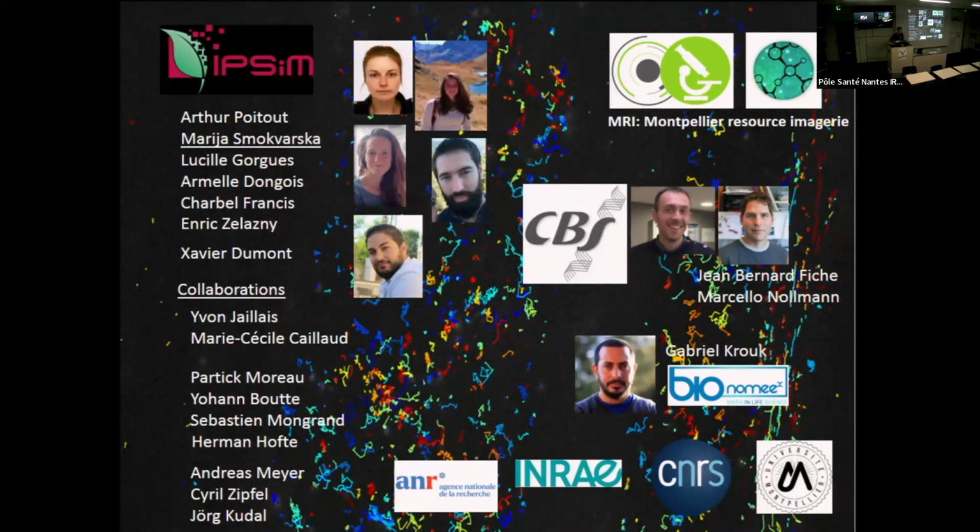So yes, one remark about this. We did super resolution in tissue, in embryos, and we are clearly in HiLo illumination and not in proper TIRF. But the important thing is that you get super resolution at the end. Yeah, sure. This is really an important point.